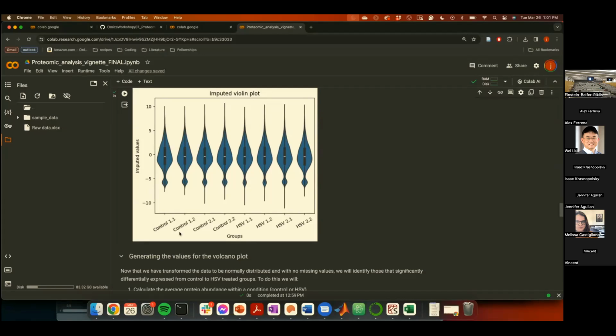So we multiply that random formula by 0.3 so that we narrow down the variation of that imputed value, specifically 0.3, because based on the many proteomic experiments that we do, that is more or less the intrinsic variability of a proteomic data set. So that's a very good question. But you can actually calculate your own if you want to do it more accurately.